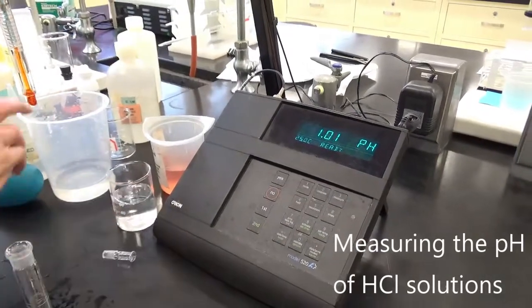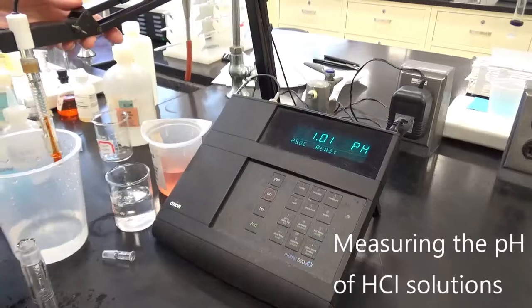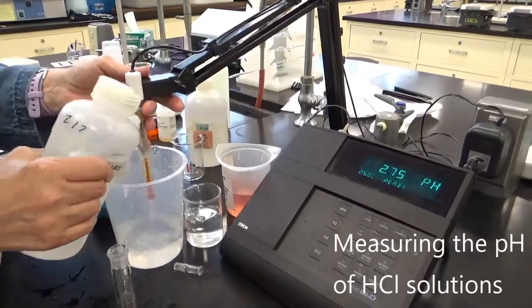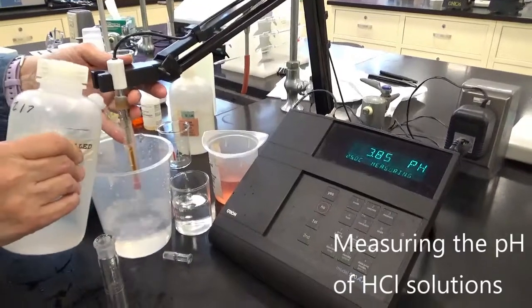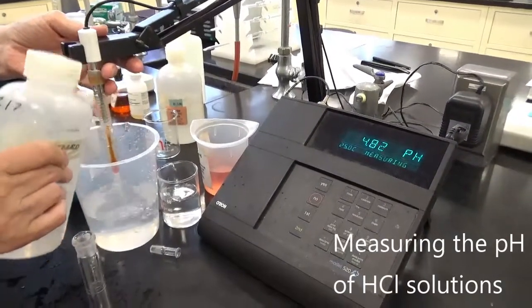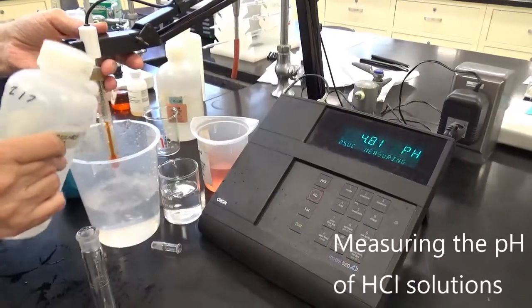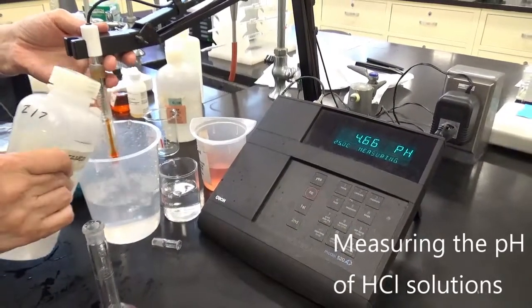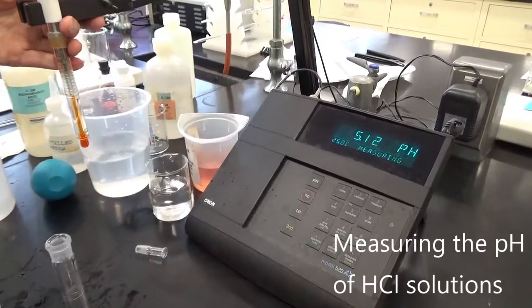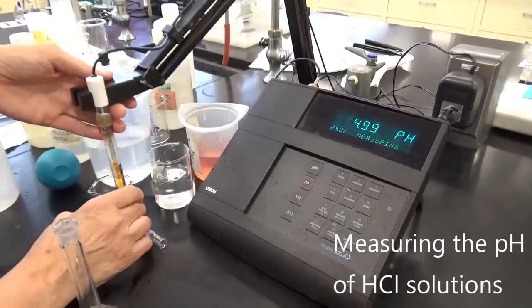Moving right along, I am going to now rinse this. Now my acid is getting more and more dilute, so I better use a lot of water here, because if I get an extra little bit of concentrated HCl, I could change the pH a lot. So I hope I did a good job rinsing. So now I have my first dilution.